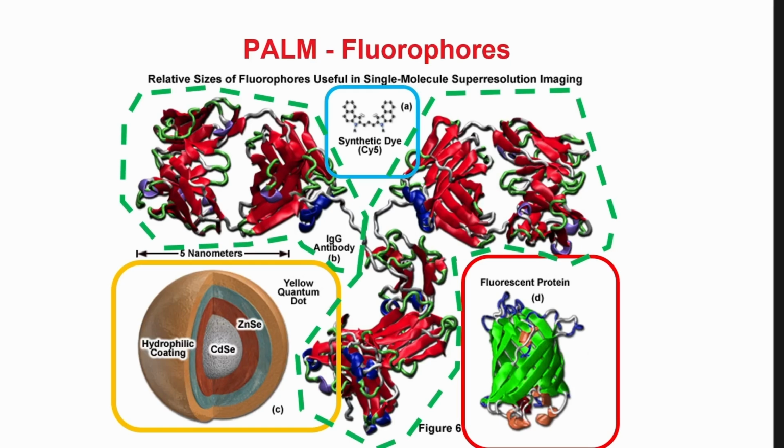And then you can also use solid-state devices, so-called quantum dots, which are very, very tiny molecule-size dots made of semiconductors, where by building these shells properly, you simulate a molecule in the sense that this structure can be illuminated and will have electrons excited and then electrons coming back and emitting photons. So this is a simulated fluorescent molecule. The advantage of this is that the optical properties are entirely controllable: which wavelength range will excite, which wavelength range will emit, how long the electron will stay in the excited state, and so on.